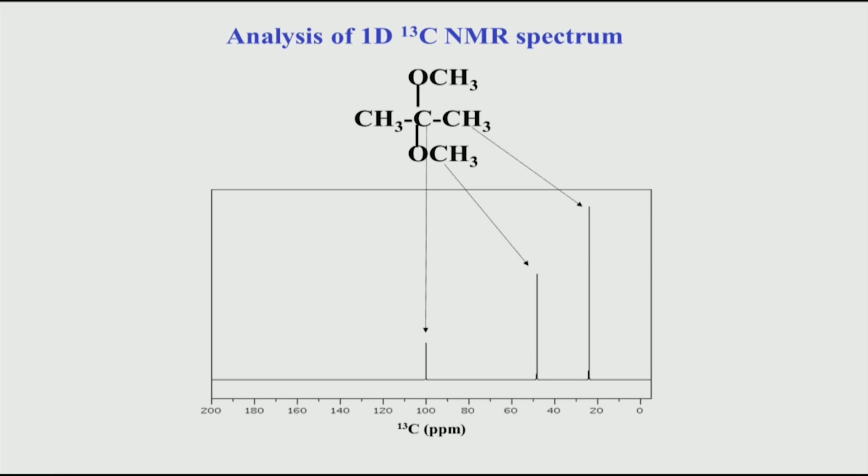This is something we saw earlier, that you need 3 to 5 times the relaxation time T1 for the relaxation delay value. So, if you have a long relaxation time, you need a correspondingly longer relaxation delay. But practically it is not possible to do that, because this may run into several tens of seconds. So, you cannot afford to wait 5 times 10 seconds, which is about a minute, whereas other carbons may have a short relaxation time, only a few seconds.